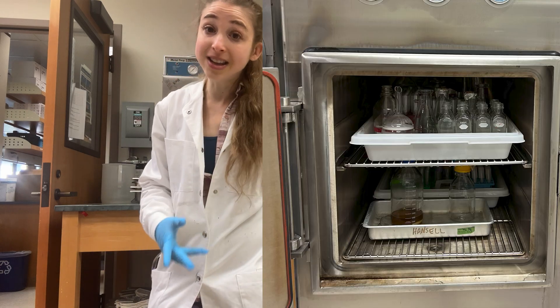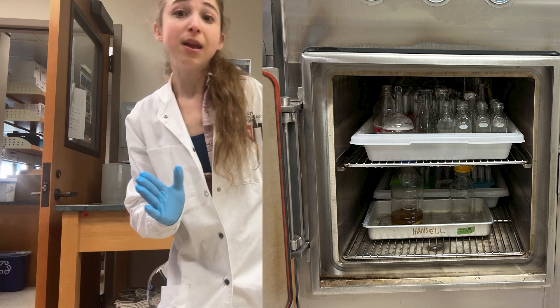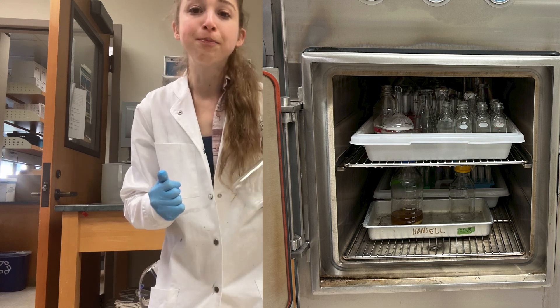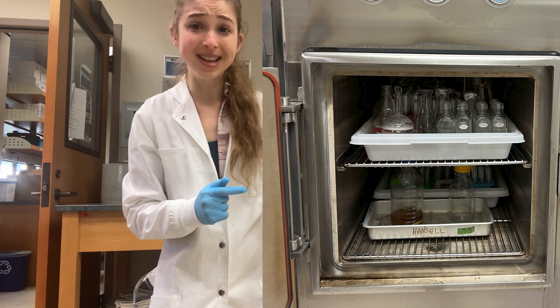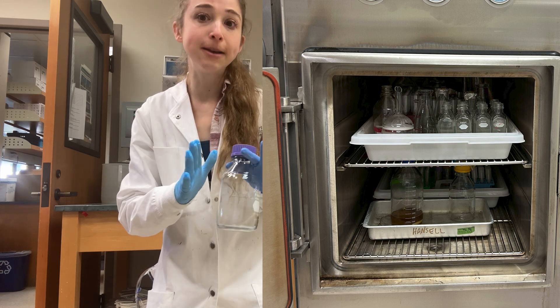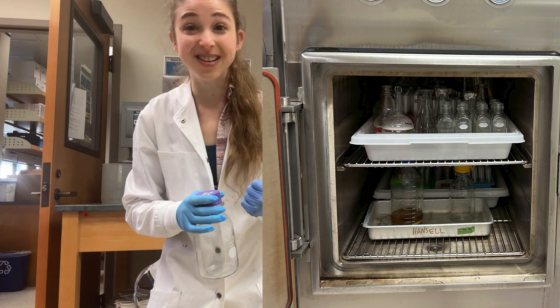When you put things in the autoclave, sometimes you're going to have liquids and sometimes you'll have solids. The reason why it matters that you know what you have is that there are actually different cycles you can set on the autoclave for different things. So if you have liquids — even if most of the stuff is solid but you have some liquid — you're going to need to set it on the liquid cycle.